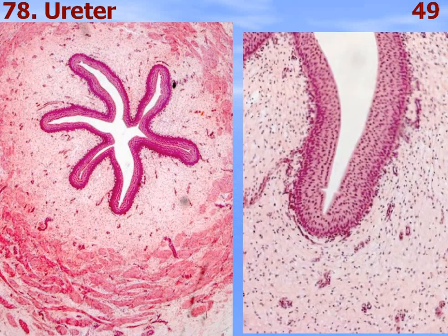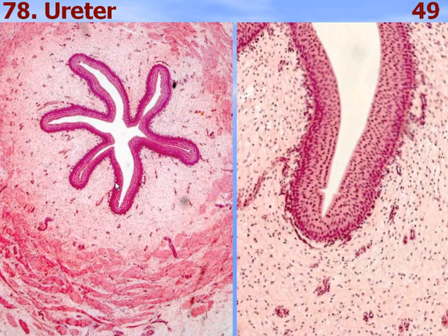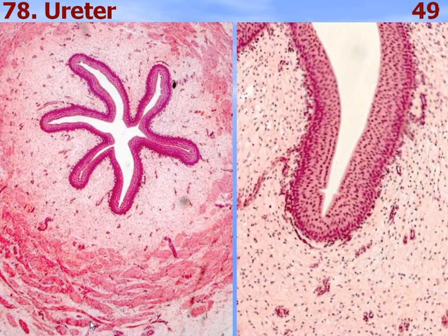The ureter is a typical tubular lined organ consisting of three membranes: inner mucous membrane, middle muscle membrane, and outer adventitial membrane. The mucous membrane consists of two layers: stratified transitional epithelium and lamina propria consisting of loose connective tissue. The muscle membrane consists of two layers of smooth muscle cells — inner longitudinal and outer circular layers — and around it is the adventitial tissue.